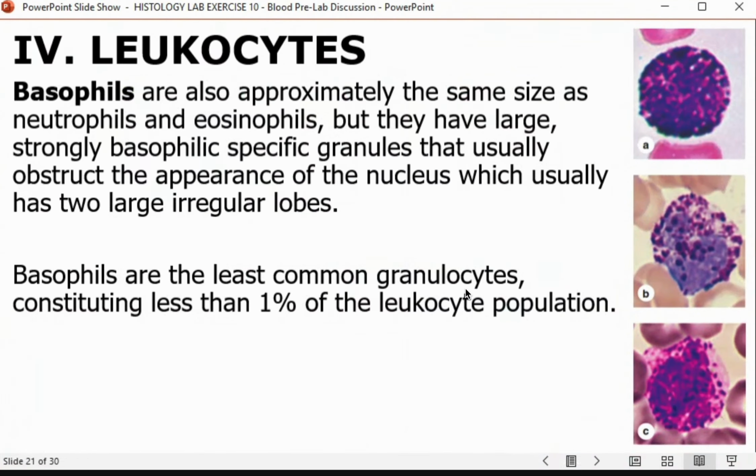Your basophils, the third of your granulocytes, they have naman, their differentiating characteristic is their dark purple granules. And as you can see here, this one and the pictures on the right are basophils. This one, so many granules, so many dark purple granules. This one also has dark purple granules, although what's happening here. And so it's same as this one as well.